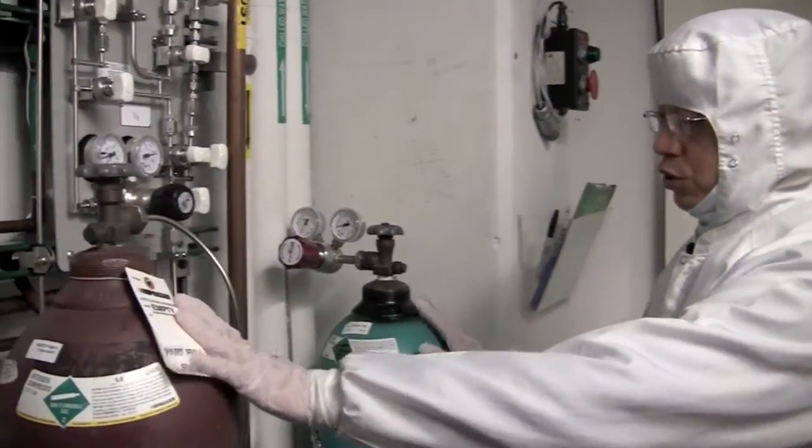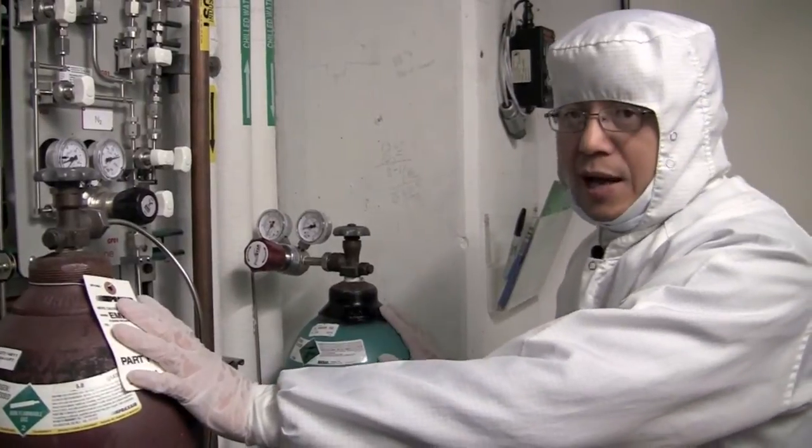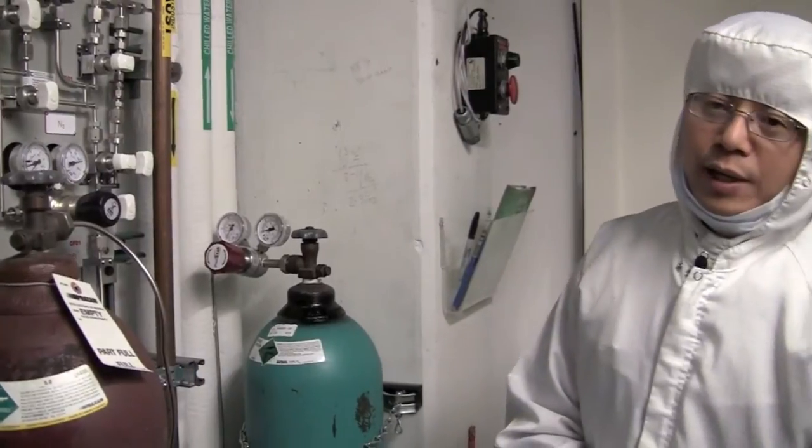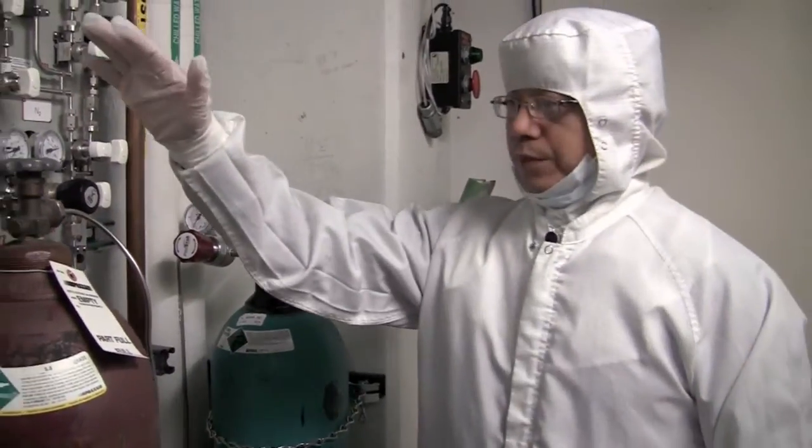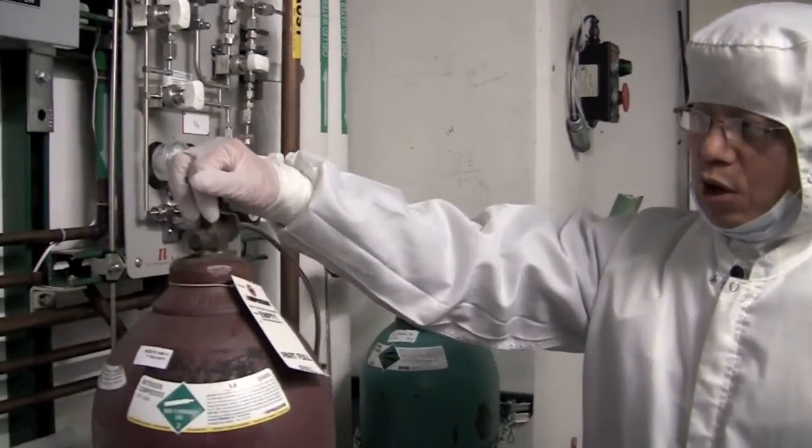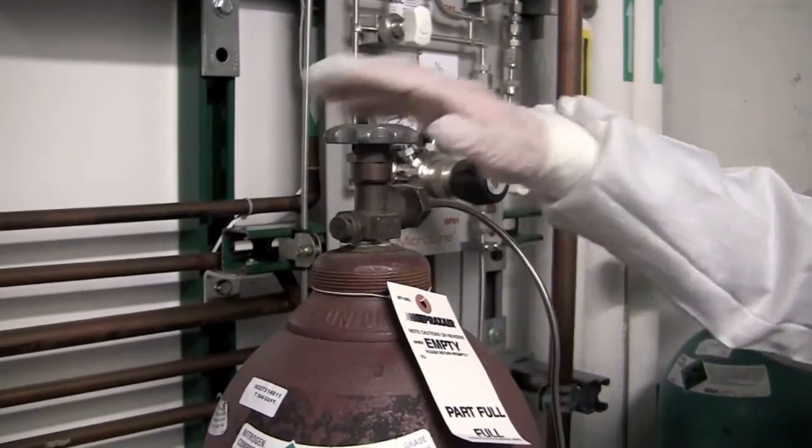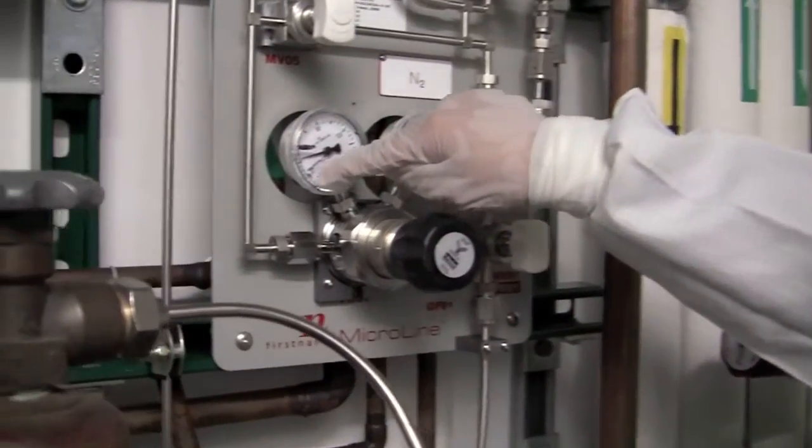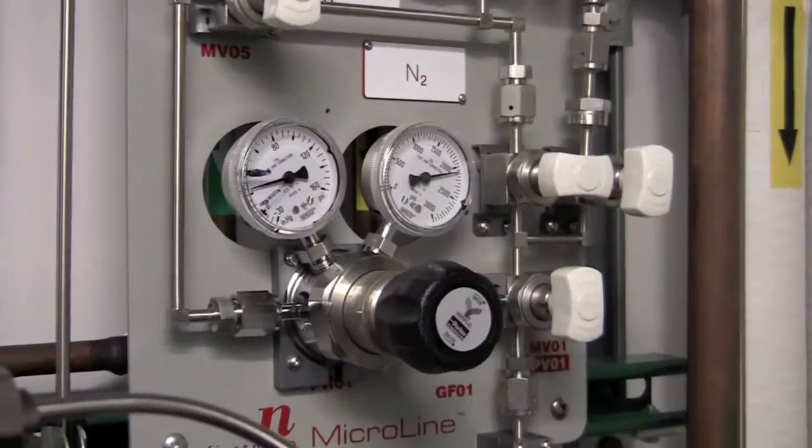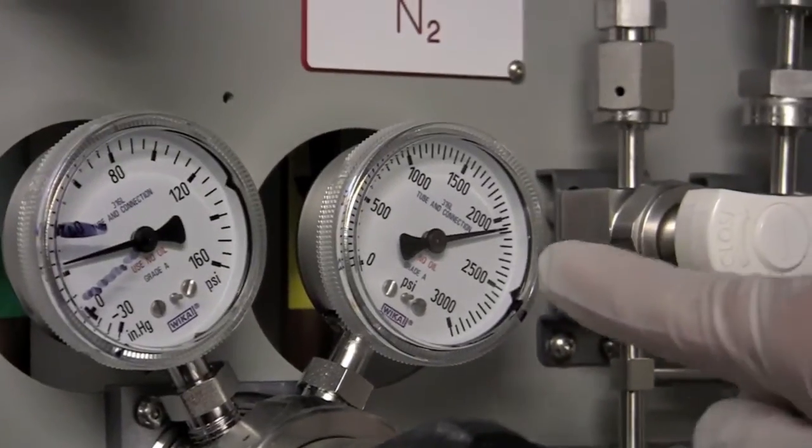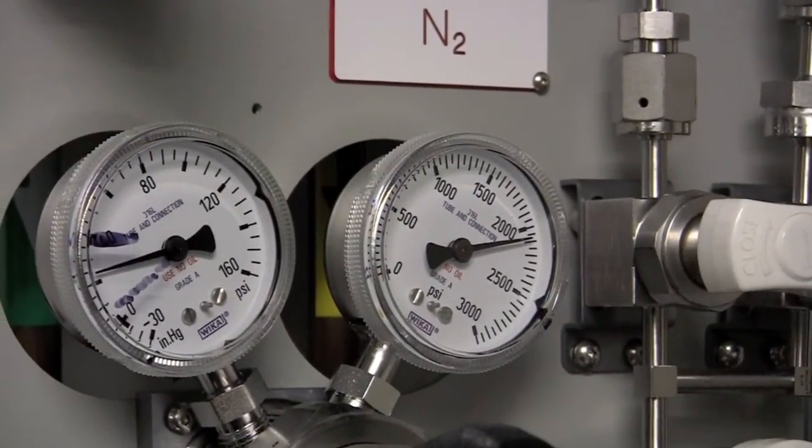And you see two tanks here. Both of them have a high purity, five nines, which is much purer than house nitrogen. And the house nitrogen doesn't meet the requirement for the system. So this tank should be always open. The valve should be always open. So you should make sure the valve is open. And the pressure should be between these two black bars, which is about 10 psi and 40 psi. You should also record this pressure number on the log sheets later.